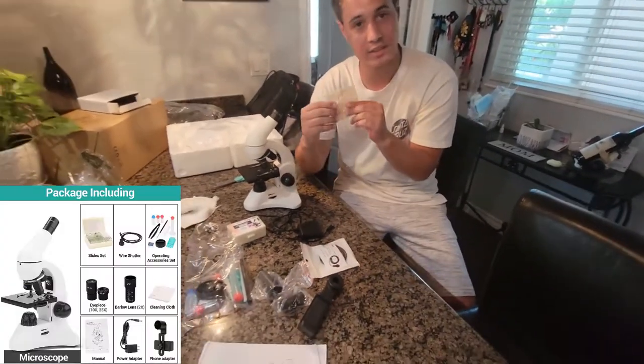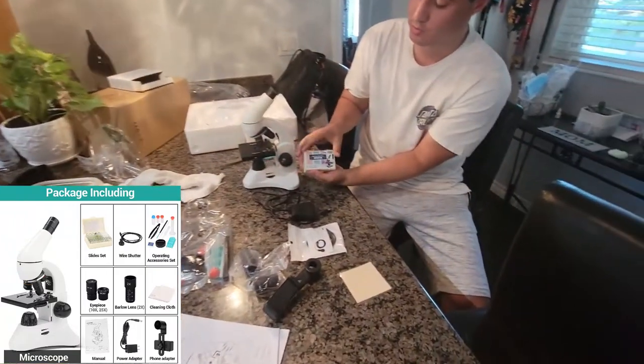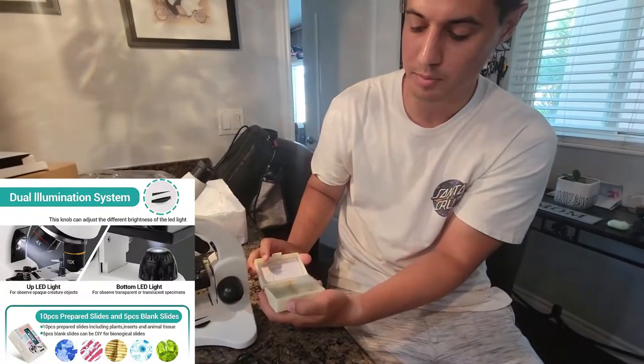It also comes with a cloth that you can clean your lens with. It comes with some microscope slides — there's prepared slides, and there's blank slides if you want to prepare your own.